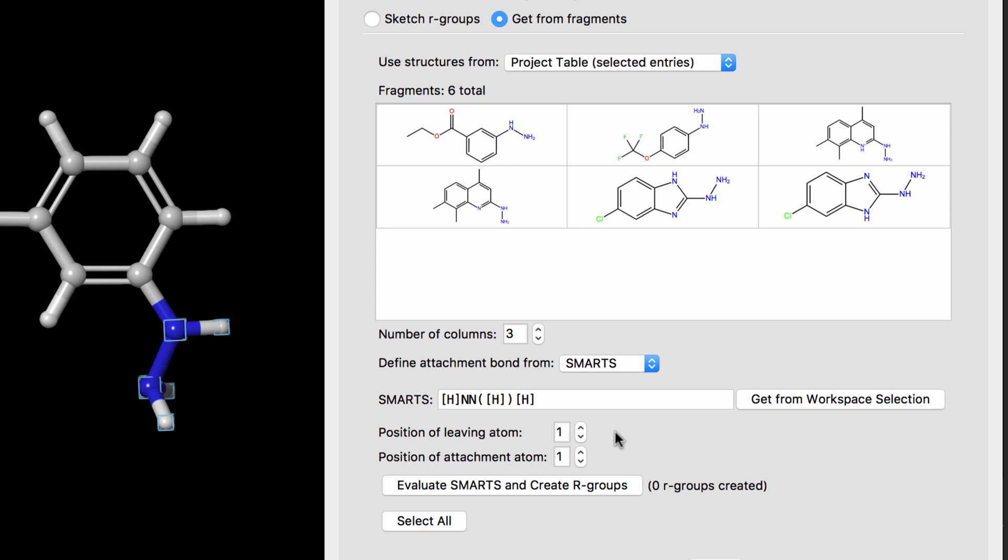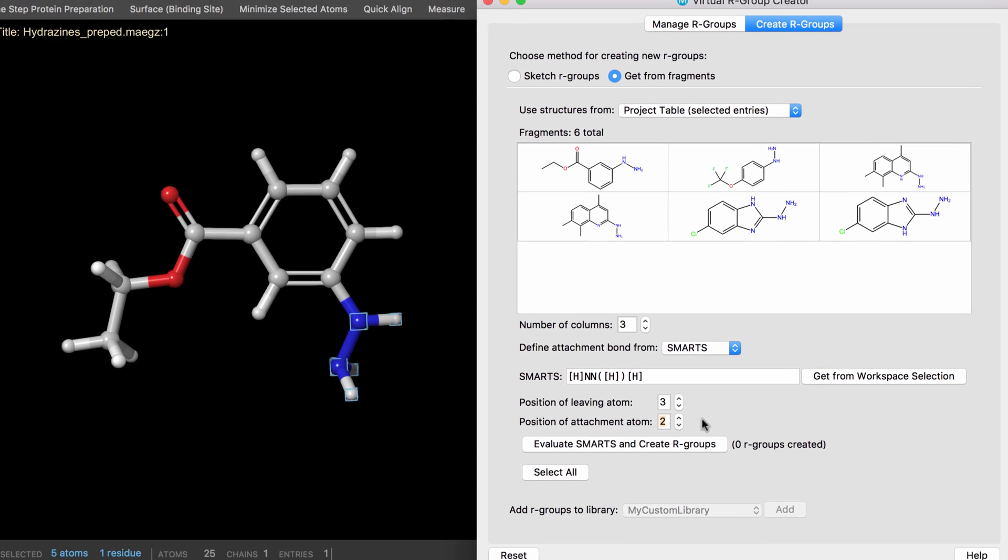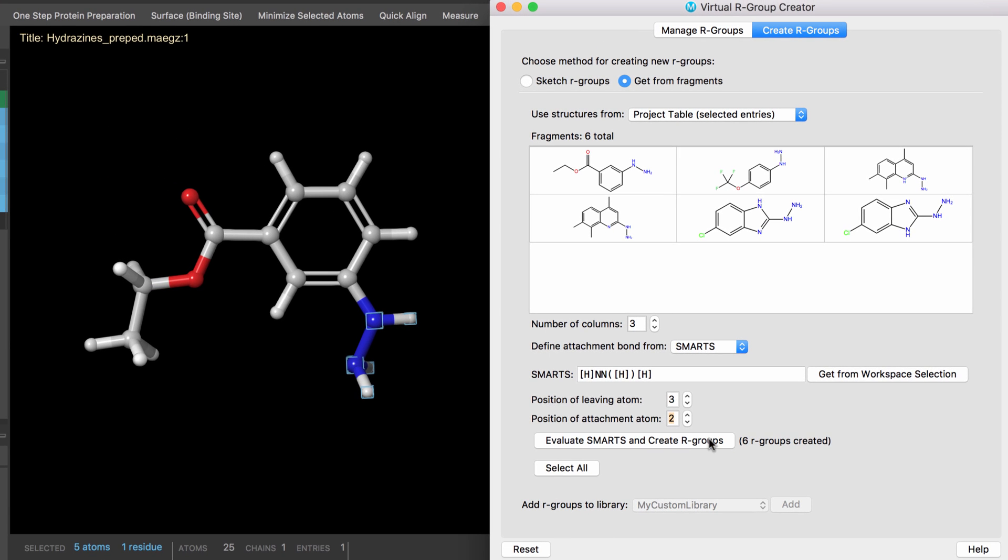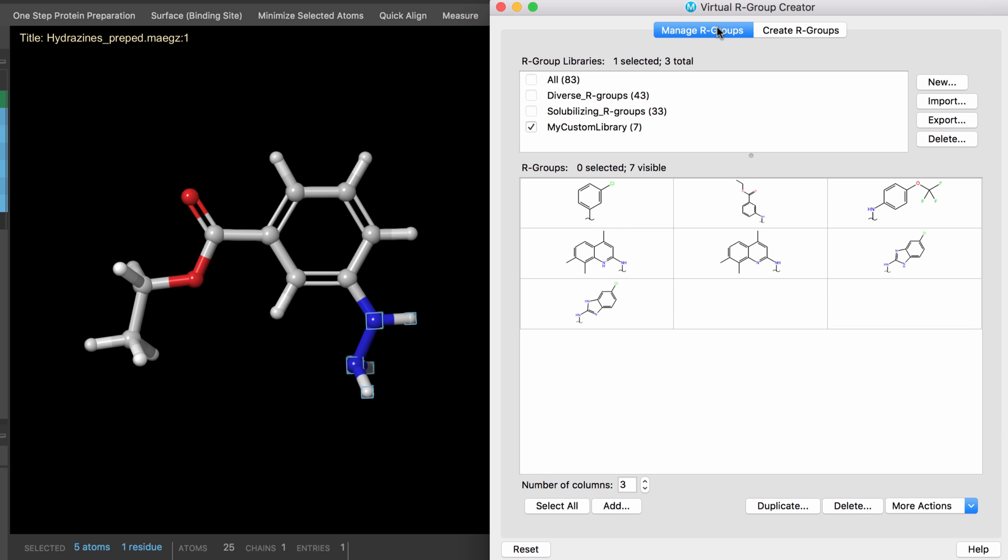And then, exactly how the R-group is defined is done by specifying the bond's leaving atom in the SMARTS pattern, i.e., the atom that is part of the structure that will be discarded, and specifying the attachment atom, that is, the atom that is part of the structure that will form the R-group. Once defined, the new R-groups can be easily added to any user-generated library.